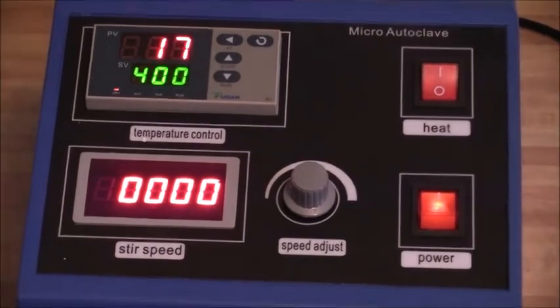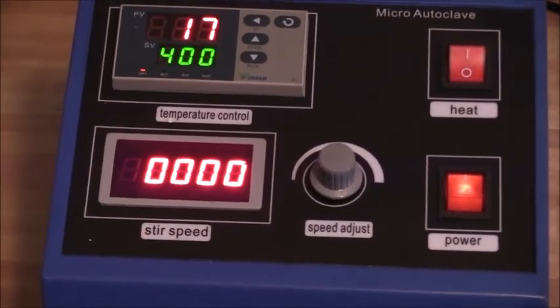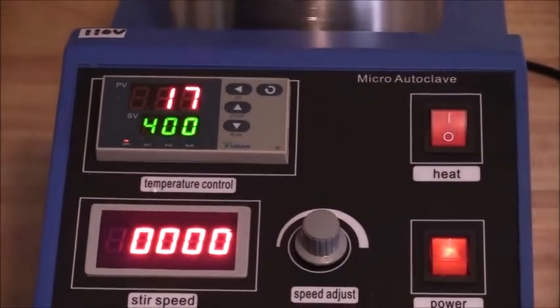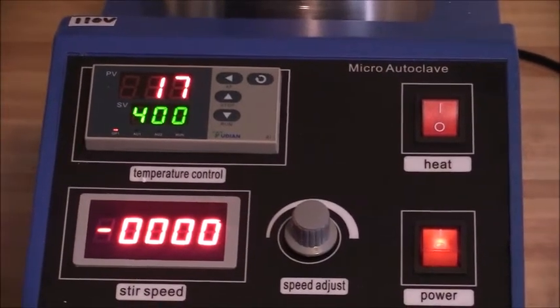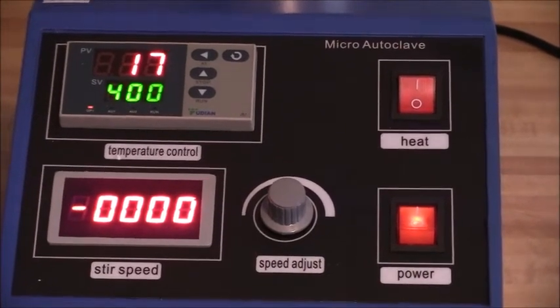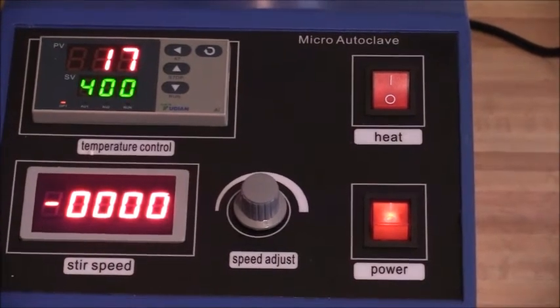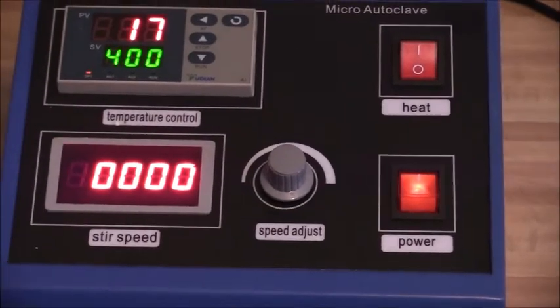Hello YouTube. My brand new hydrothermal reactor has finally arrived. I wanted to upgrade to this deluxe model because it has a digital temperature display and a pressure dial to indicate the internal pressure of the vessel during an experiment. I plan to try the experiment again in attempting to convert carbon monoxide and hydrogen into fatty acids. This time I will be using this reactor to do it.